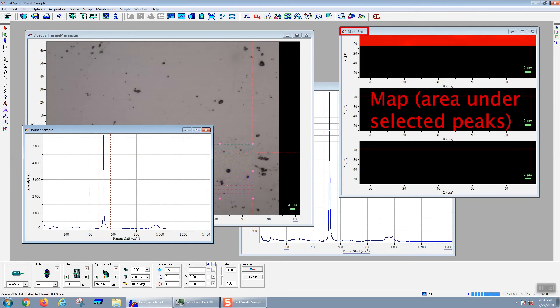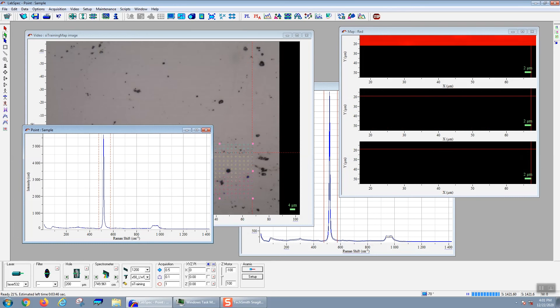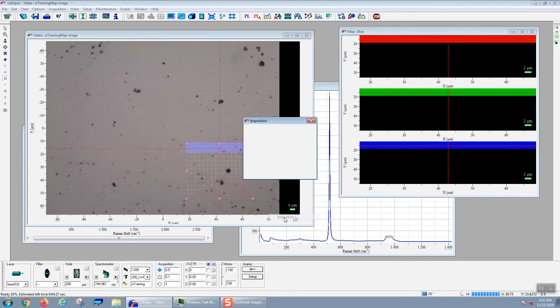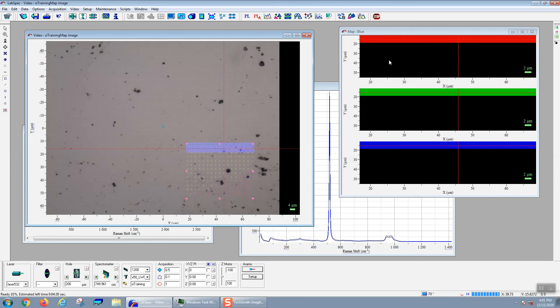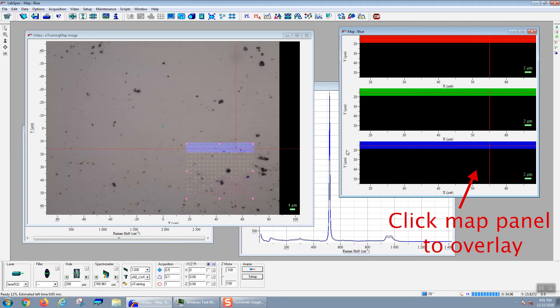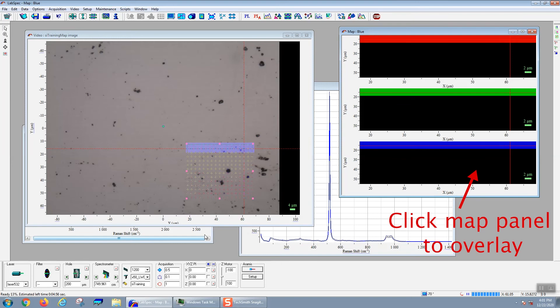If you want to overlay the colored maps, your hyperspectral image, onto your video image, you can right click on the video image and select imposition. That will open up this dialog box and you should check overlay images. Then you can click OK. If you don't see any overlay, you would go to the camera image and then click on one of the colored maps, for example, the red or the blue map. That would overlay whatever map you clicked on onto the video grayscale image.